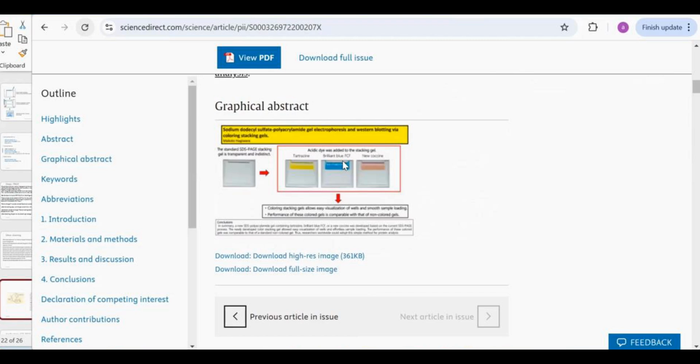So you are going to have the ampholyte zones, and the specific protein, when it reaches a zone where its pH matches its pI value, will have net zero charge, and it will stop at that point, and it will not migrate ahead of it, right? So that is one technique that we have to discuss.